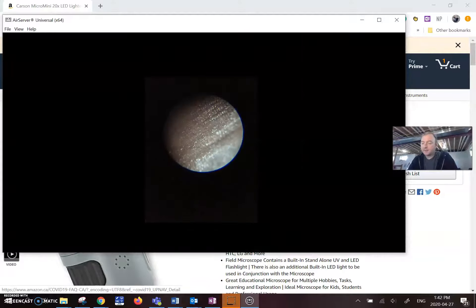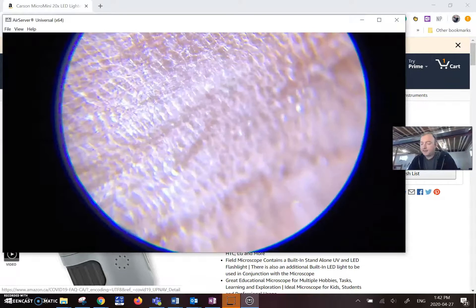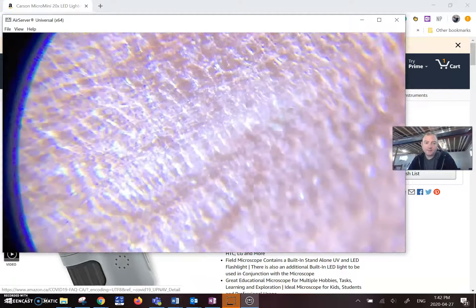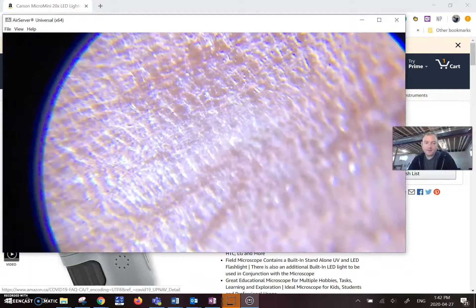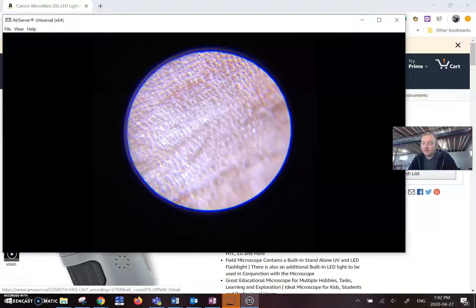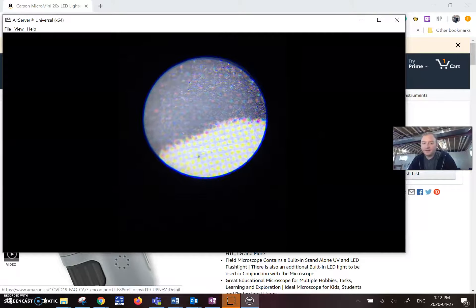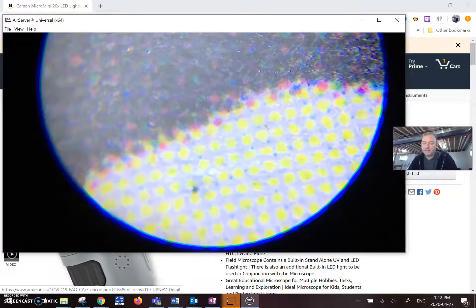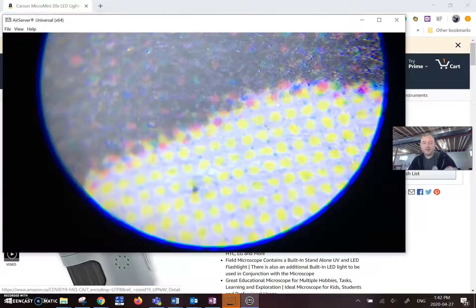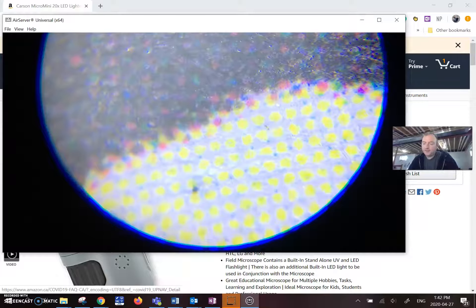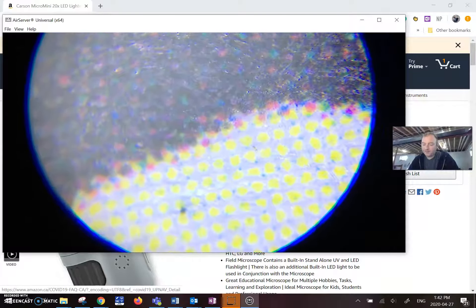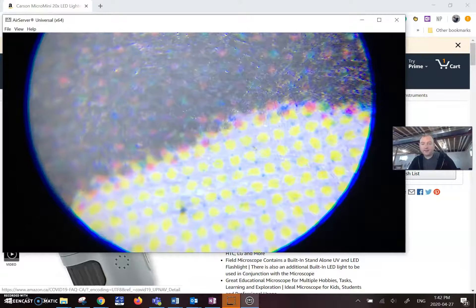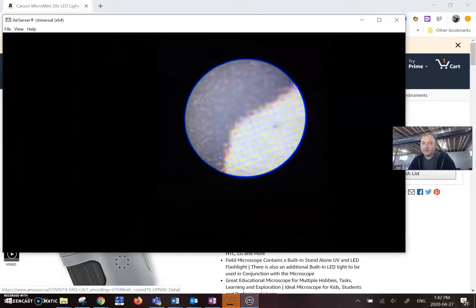I think this is a very handy thing. This is with the white light. You can see the structure. The other thing is, I think that from what I recall about my biology classes, if you had a more live sample and dyed it, you'd have a much better visual. The piece I had was just the brown part on the outside of the onion. But here is a picture of the fake bill. And of course, on the fake bill, you can't see any of these individual color dots. But once you've zoomed in, you can really see the parts in there.